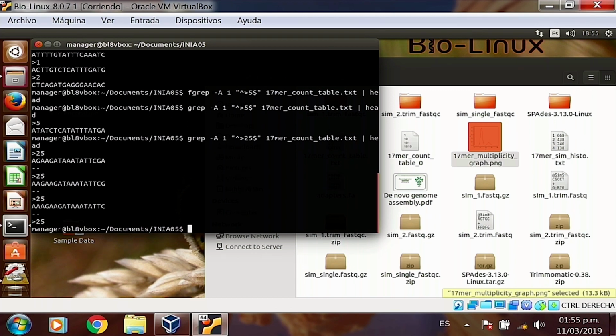Did I put after? Oh, interesting. All right. Yeah, so that's basically what we're doing. What we want to do is create a table where we don't care about the Kmer sequence anymore. All we care about is how many times each Kmer has been counted, and then how many Kmers that appeared 25 times also appeared. Does that make sense at this point?